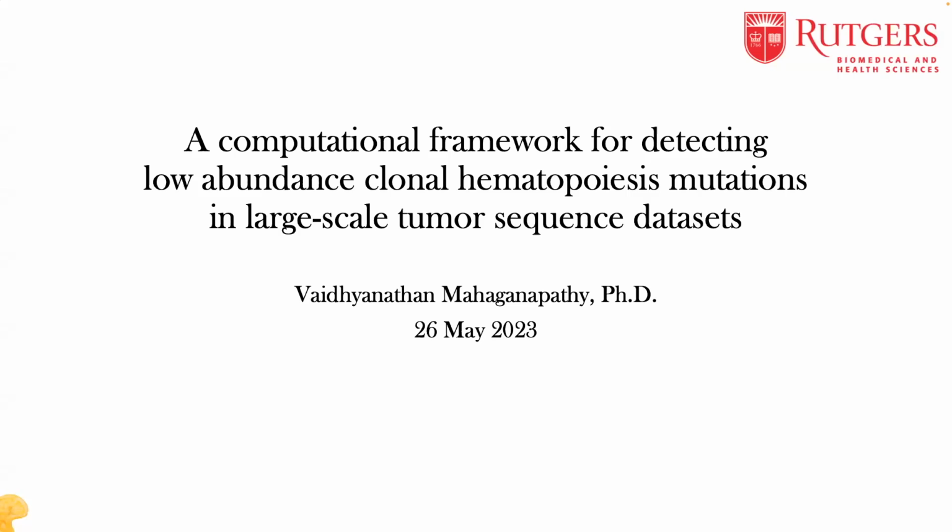In this webinar today, he's going to summarize his work with Dr. Khiabanian's group on developing the MERIT pipeline on the CGC. So MERIT, which stands for Mutation Error Rate Identification Toolkit, was originally developed by another lab member, and it's a multi-step pipeline that utilizes Samtools to identify all positions with alternate alleles from aligned reads. It then extracts additional information from these variants.